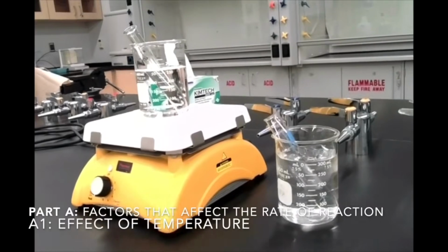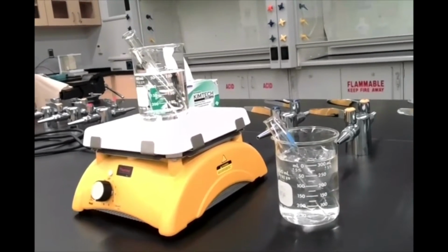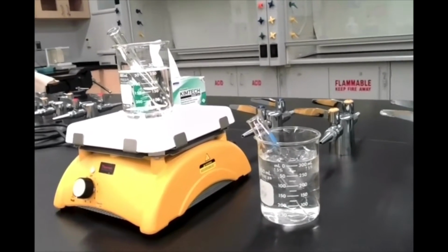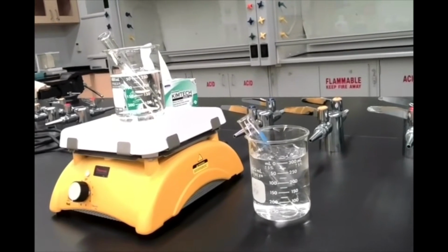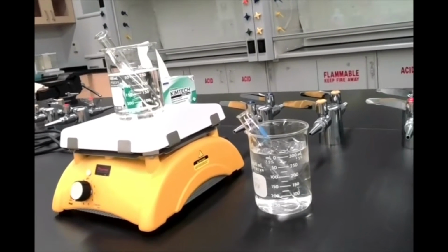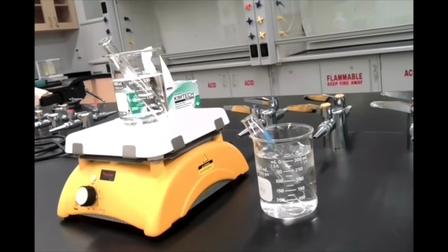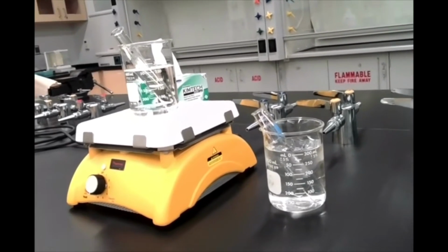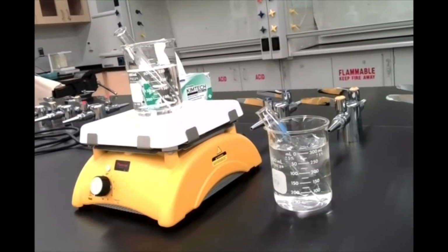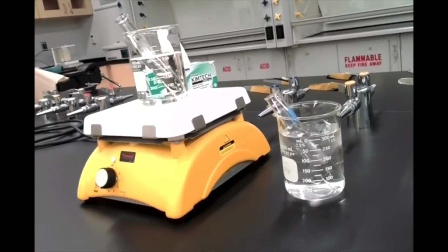So over here I've got two test tubes, each with 10 milliliters of 0.1 molar hydrochloric acid. We're going to look at the effect of temperature on the rate of reaction. So we're going to add some sodium bicarbonate or baking soda to the samples of hydrochloric acid and see how quickly the carbon dioxide bubbles clear away. Now, we have a hot test tube and a cold test tube, so we're going to see the effect that temperature has on each of these solutions.